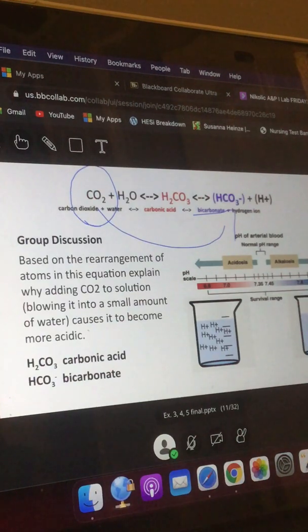Any questions about that? We would do these all in the lab as the experiment that you saw in the video if you watched it. And again, you didn't have to. That's okay. We did it here. All right. Any questions about that? So, yes. So that's it. That shows you how a buffer system kind of works as you're looking at an unknown substance.